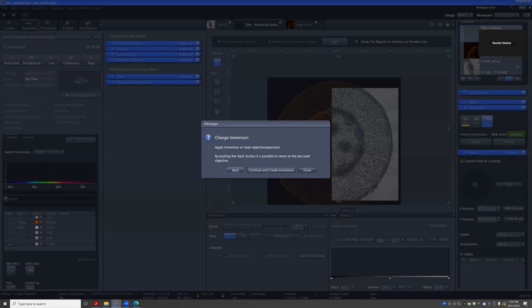So you do want to keep an eye on that reservoir. You can actually see it does monitor the tank level. It's basically reading a current that goes through here. The more water there is in there, the better it can read out what the value should be. Once it gets below a certain point, it'll say, oh, your tank is running low.